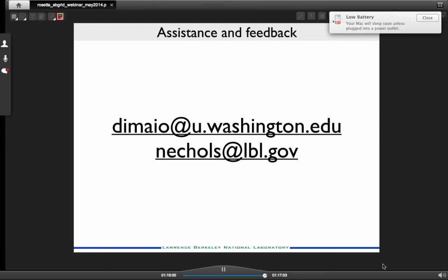And I think we'll take one final question from someone attending here. I know this is mostly for academic crystallography structures. I want to know if it can also be used for EM. Yeah. So this program is not, but Frank is actually working on that right now, I think doing EM refinement, and we're also working on some of that separately here. I think definitely some of the same methodologies will be applicable to EM refinement. I'm not sure what the current status of the programs is, but you should email Frank if you're interested, and he can give you details.